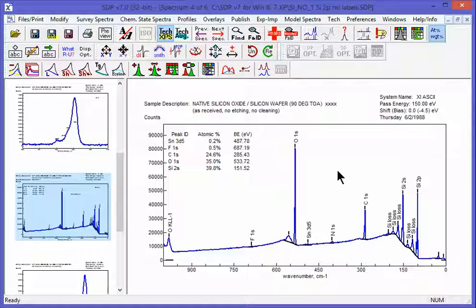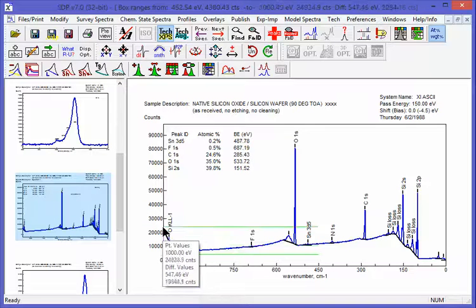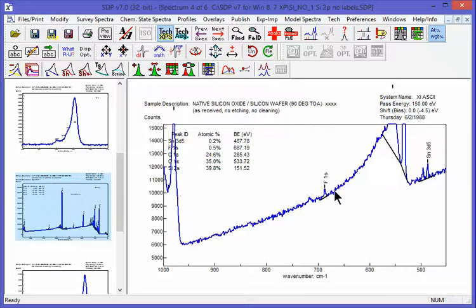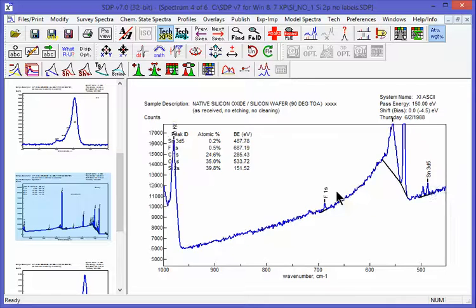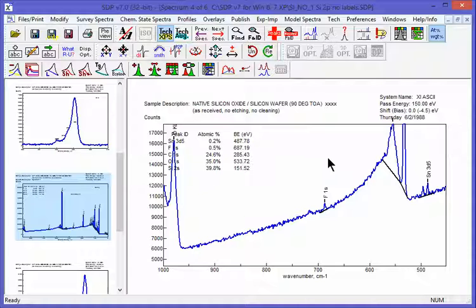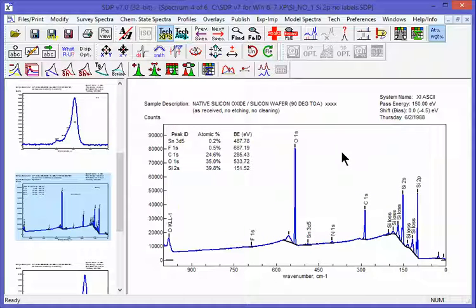Okay, so I right-clicked and zoomed everything out. Now I can also zoom into this region in this fashion. And another way we can zoom in is by using the Shift key and using this roller scroll wheel on your mouse. So I'm holding the Shift key and moving the scroll wheel on my mouse. Okay, so if you want a little more fine control, I let go of that and I can right click and it all goes back to full scale.